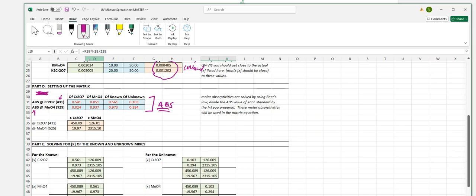And then your manganese was 5 something, so 520, 530, somewhere in that realm, and all four of those were run at that wavelength. So these are the absorbance values that you obtained from those runs. For instance, I dialed my UV at 431. I did a fixed run, and that fixed run was bloop, bloop, bloop, bloop.